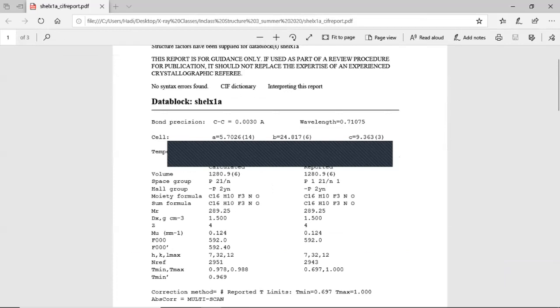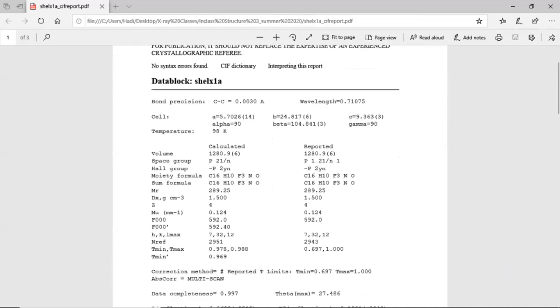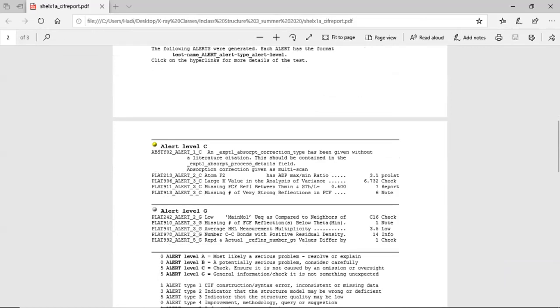Now our Z value has been updated to 4, and the moiety formula and sum formula are correct because we have the correct Z value. Scrolling down, the B-level errors are gone because we correctly assigned the atom type. It's now just C and G level alerts — this is ready for publication. That concludes in-class structure 3; before we begin the next structure I'll stop here for any questions.